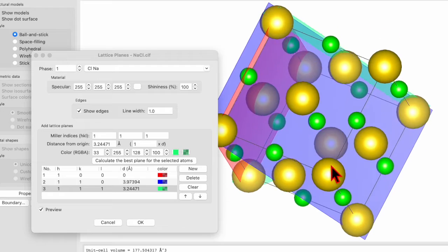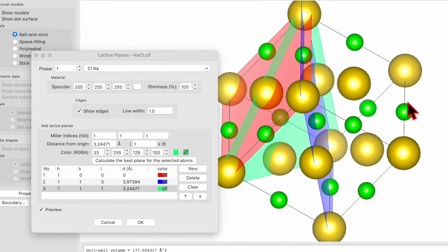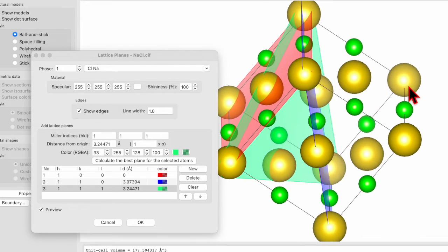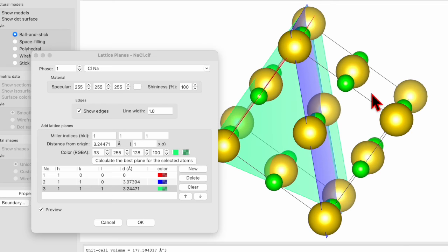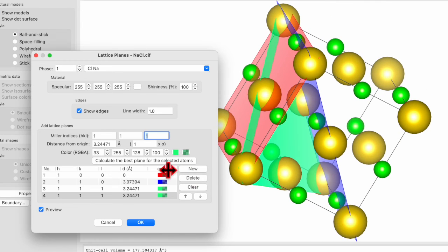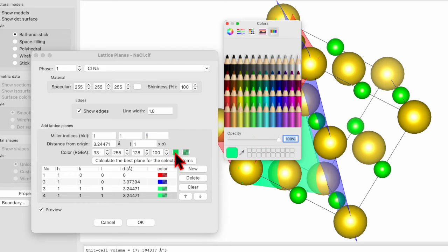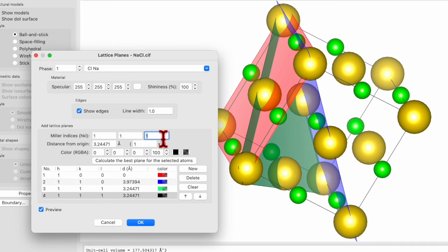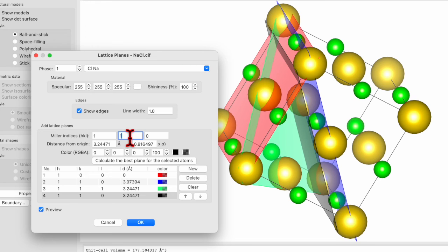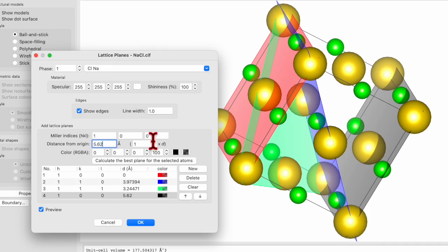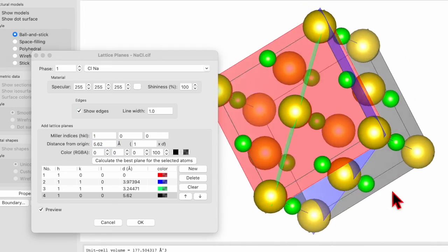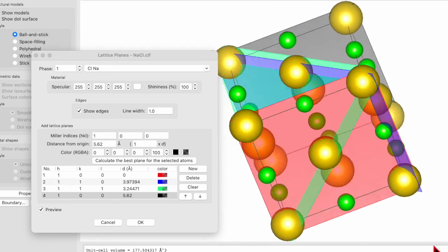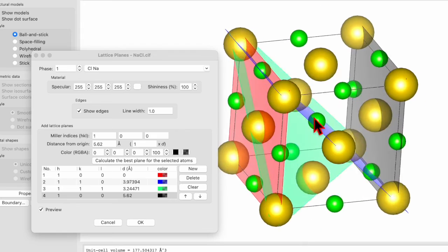So now we can see three different planes. Let's put one more plane at the end. So New, and this time change the color to black. And this plane I want to be 0-0-1 and d equal to one. Perfect.